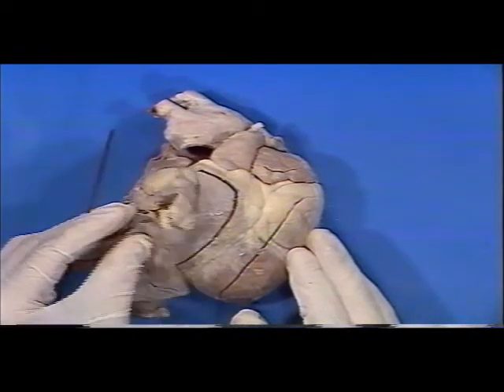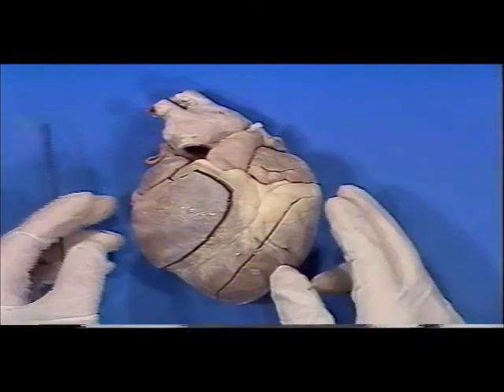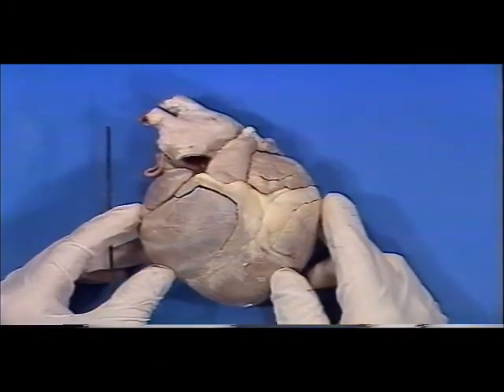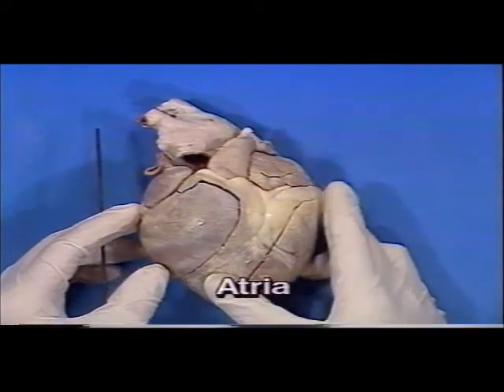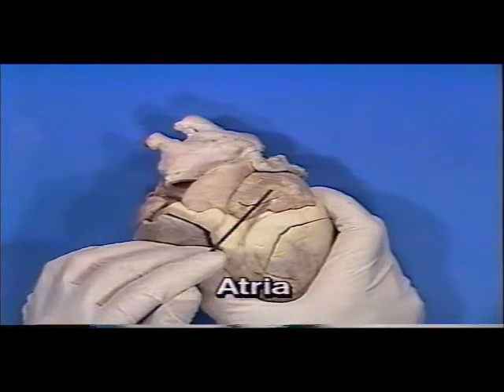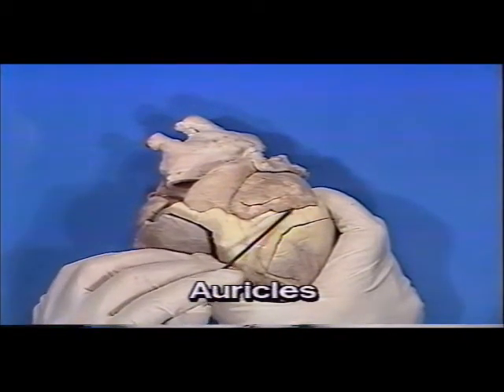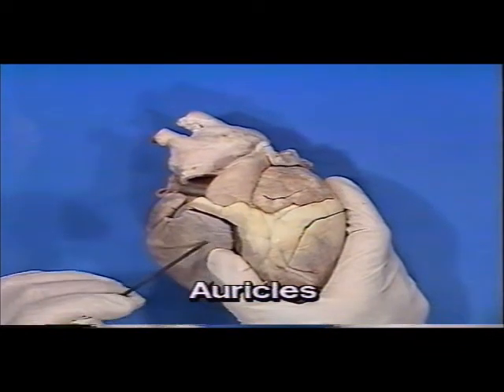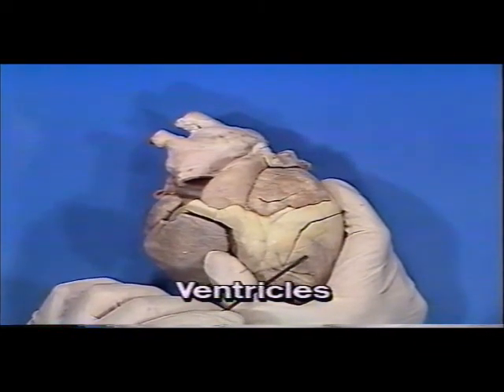There are 4 chambers in the mammalian heart. The external walls of these chambers should be explored before you begin to dissect the specimen. The 2 atria and their small appendages, the auricles, Latin for little ears, and the right and left ventricles may now be seen.